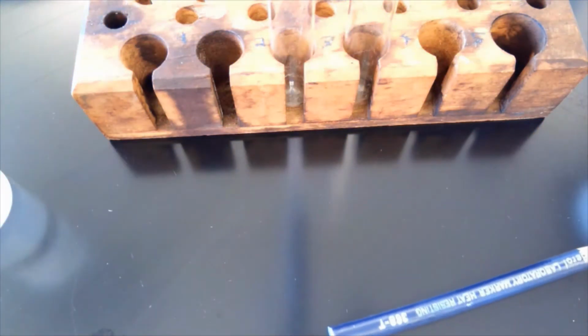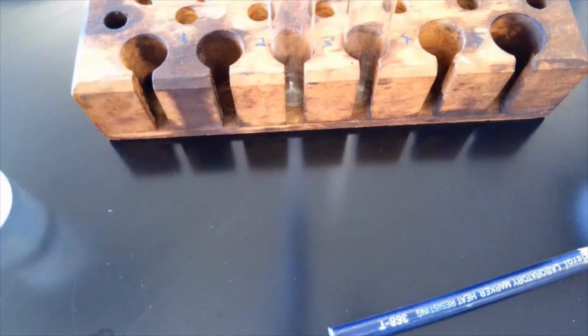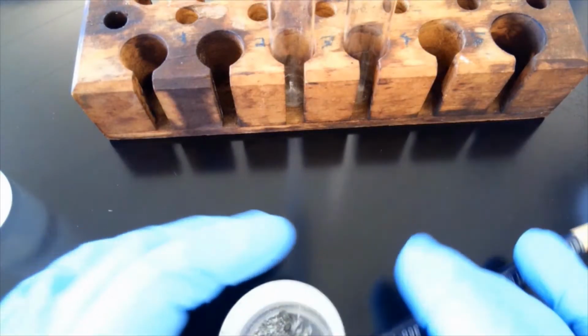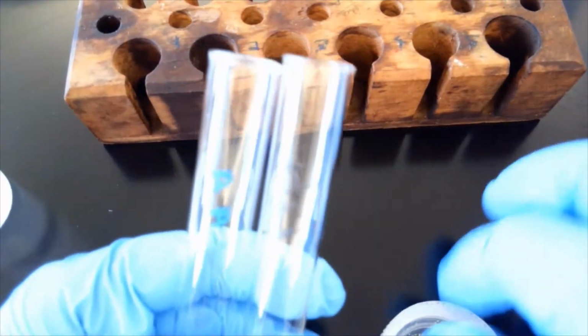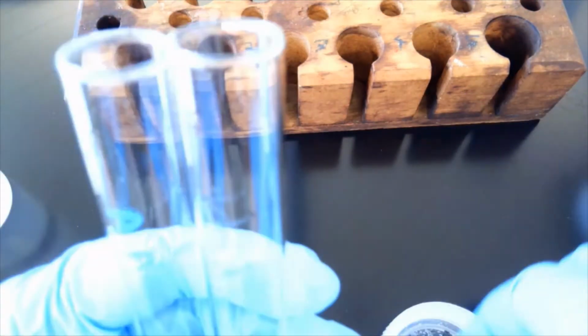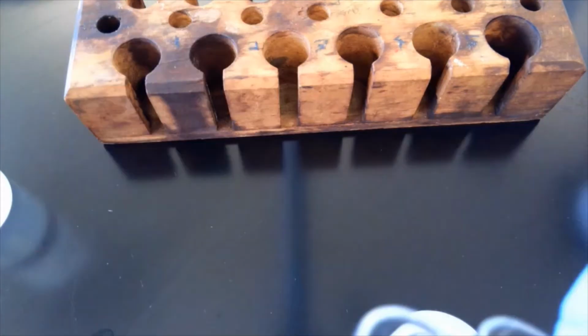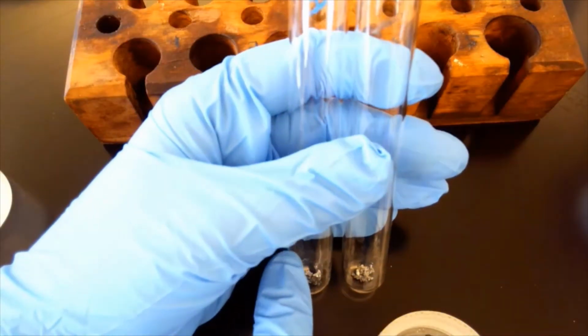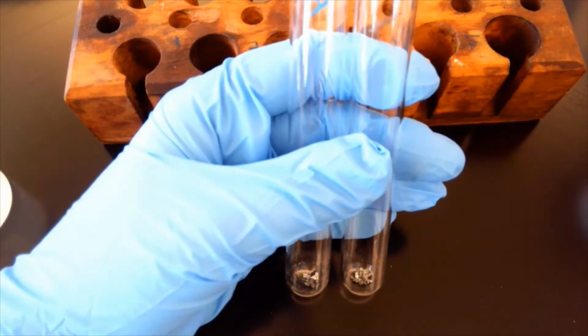So what we're going to do now is start off by putting a little bit of, we're going to go with mossy zinc to start off with, okay? So mossy zinc looks like this. It's this lovely metal. And we're going to add a comparable amount to each test tube, just a little bit so you can see what's happening. So add a few pieces into the acetic acid and a few into the test tube that is marked HCl. So now you can see the zinc in the bottom of each one.